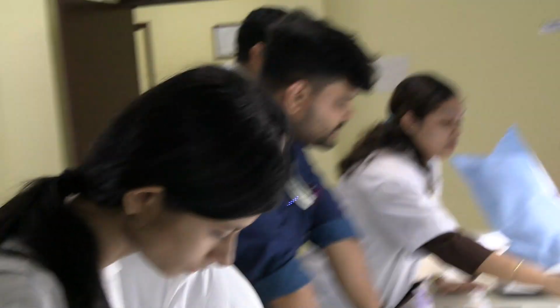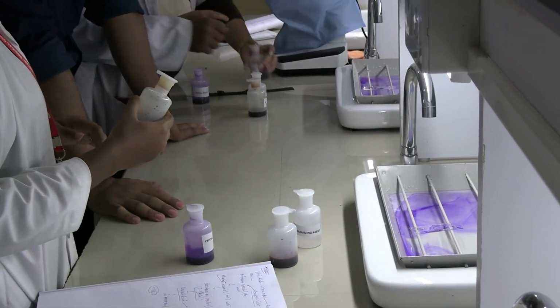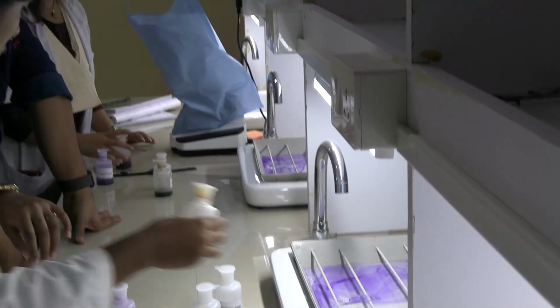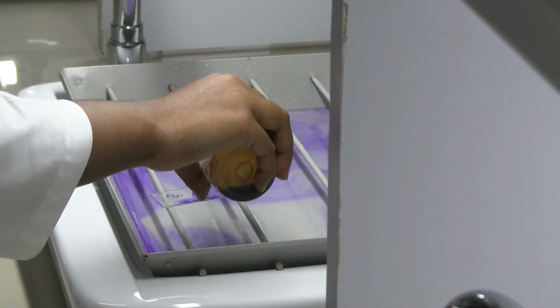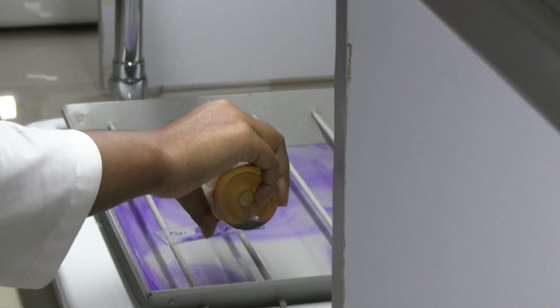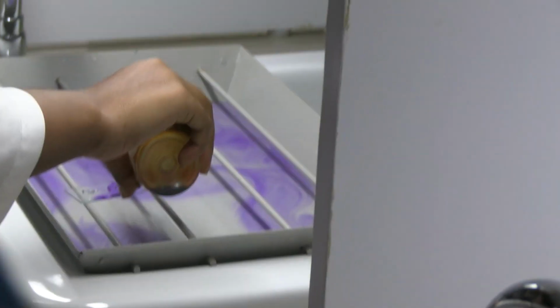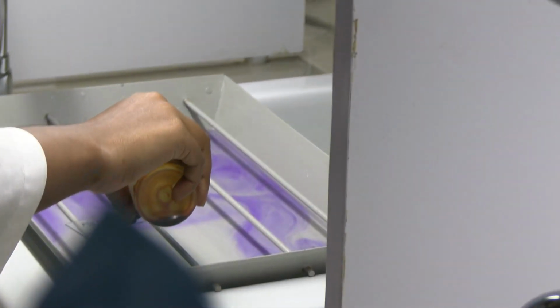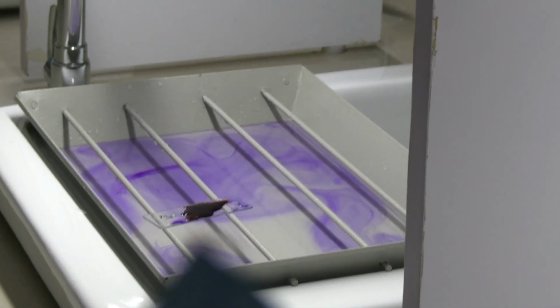Now, what is the second step? Mordant. Okay. So we're gonna take the mordant, and we'll flood the smear for how long? Mordant for 1 minute. Okay, 1 minute. Place the mordant. There's no issue. Flood the whole thing. Okay, it's enough. So you're gonna wait for 1 whole minute again, okay?